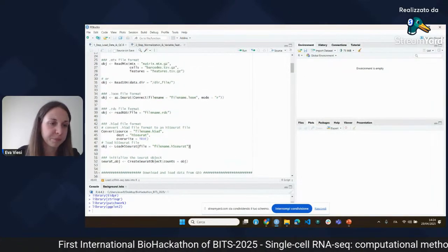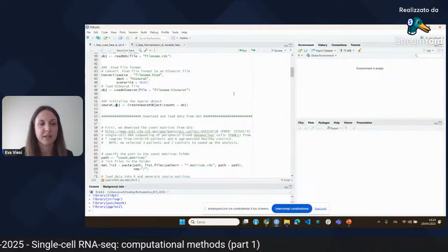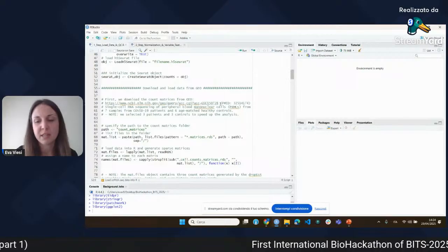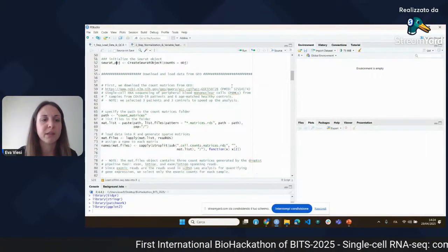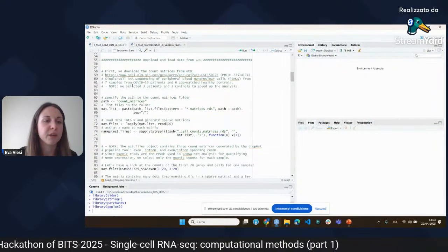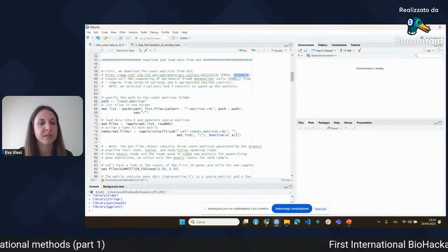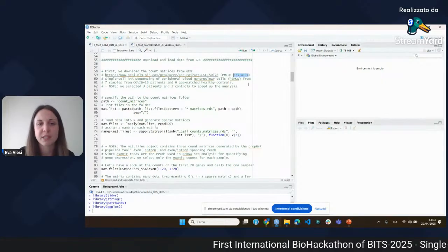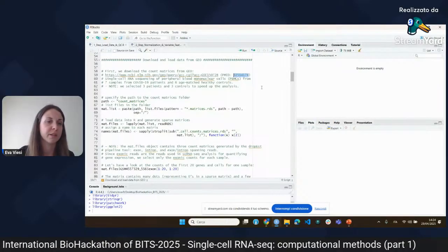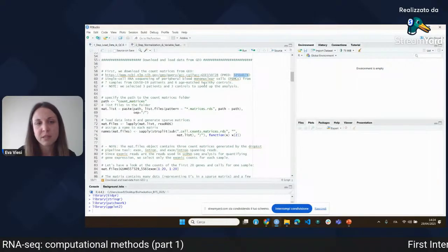So finally, we have all our count matrices, and we can create the Seurat object. So now we are going to see an example. So we downloaded data from the GEO platform. In particular, this is the PMID, and this is a single cell RNA sequencing experiment of peripheral blood mononuclear cells of 7 samples with COVID-19 and 6 age-matched healthy individuals.